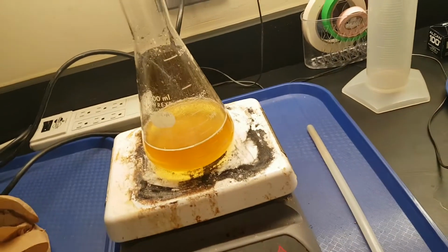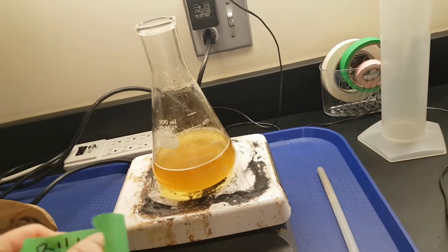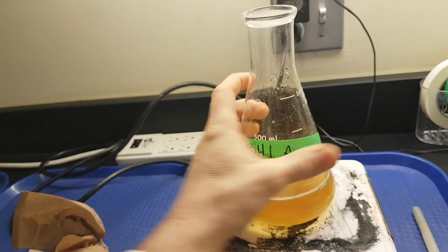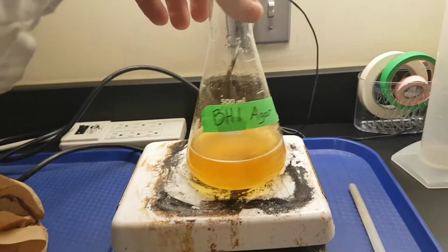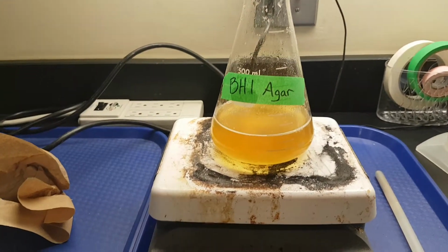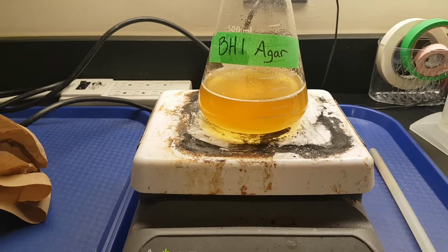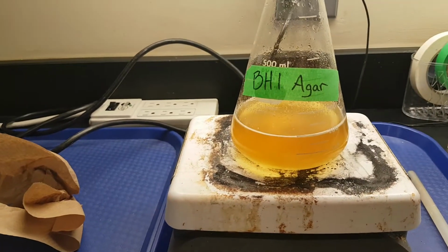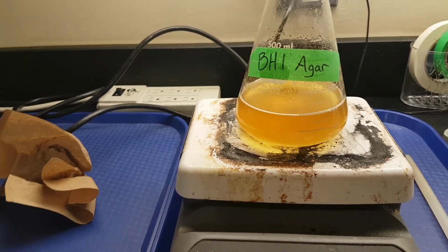Incidentally, one thing which I forgot, which you should always do, is label your media, right? You might be making several different media at a time. You might be making different volumes, in which case you would also write the volume on here, but you just write it on a piece of tape, put it on there. That way you know what's in there, and anyone else who finds it also does as well. Very important in any scientific environment, really.